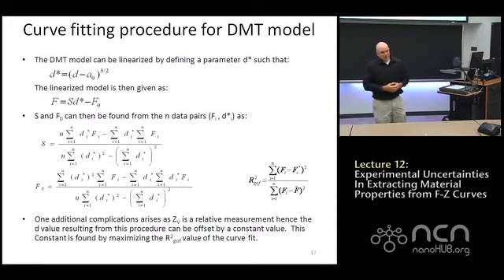I would suggest using a method, I should put the reference up here. A couple of guys suggested this method, probably 2000, 2001 or so, of using the R² value, which is just the goodness of fit parameter. If you choose your model fit such that the R² value is best, let that determine where your 0 location for D is. Probably not a perfect way of doing it, but better than pointing and clicking and guessing where the 0 D is. Let the 0 location be a part of the fitting.